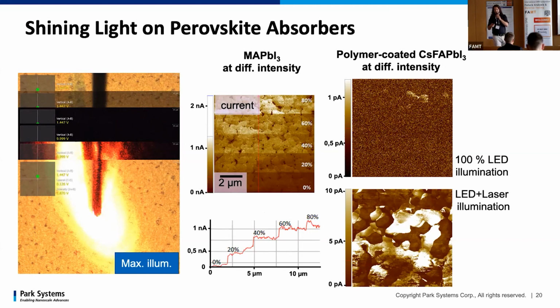However, this is still an ongoing debate, and there are probably other factors, because in very fresh, pristine films we also sometimes see these domains, though they have never seen any water at all. Another problem is that in these perovskite films you have quite a lot of mobile iodide ions. When you apply an electric field, these ions can migrate, creating vacancies that can also degrade the structure. So it's not that easy to answer.